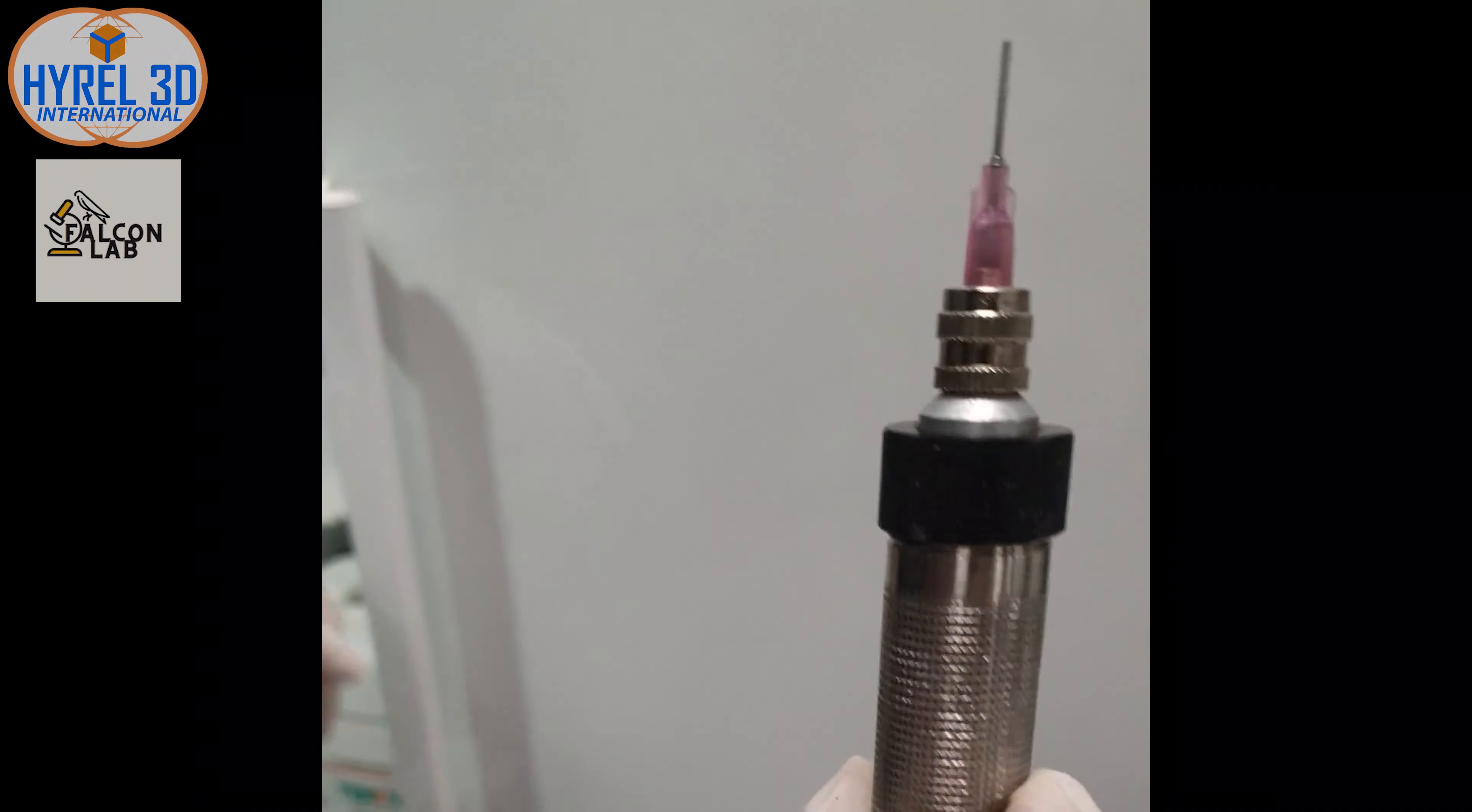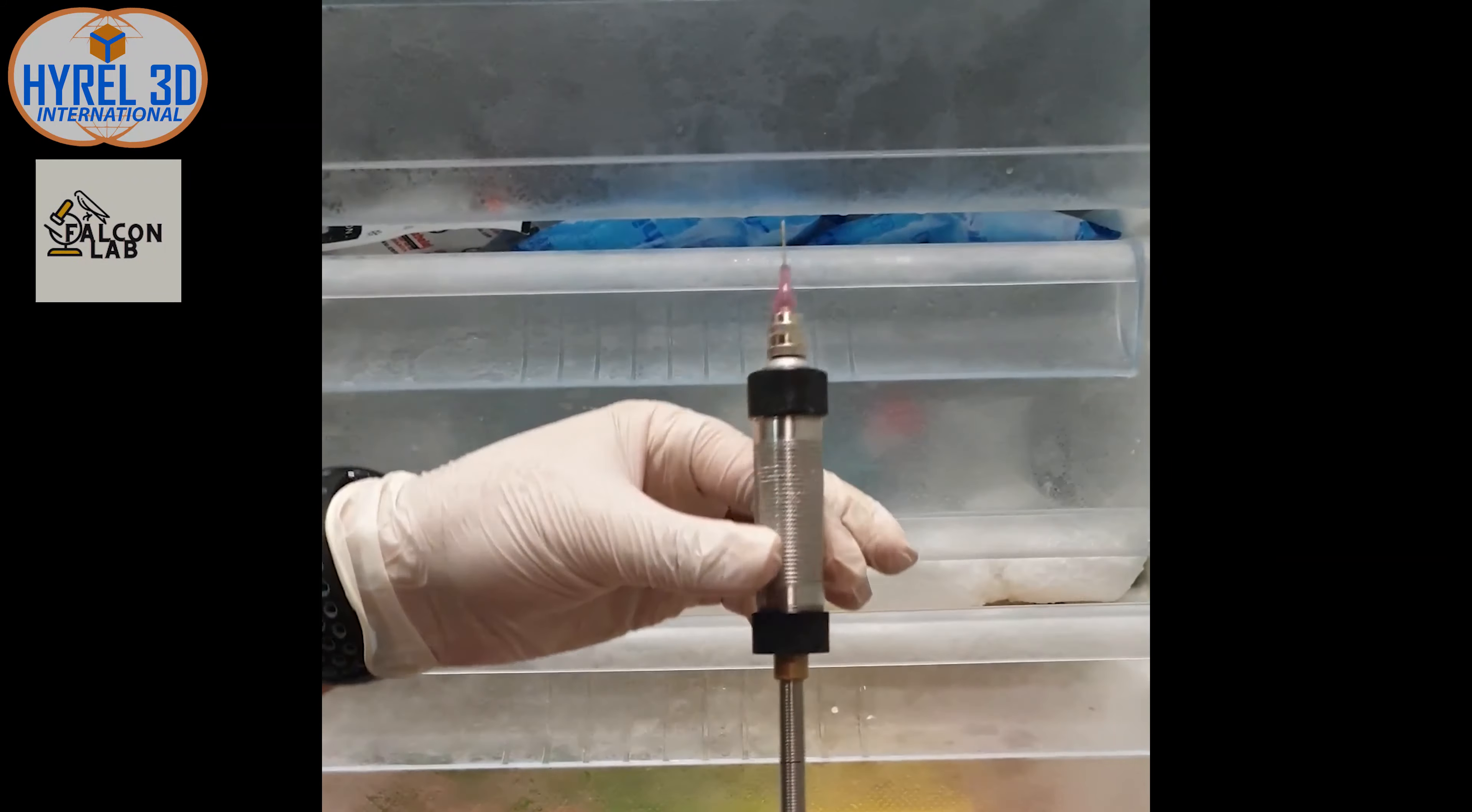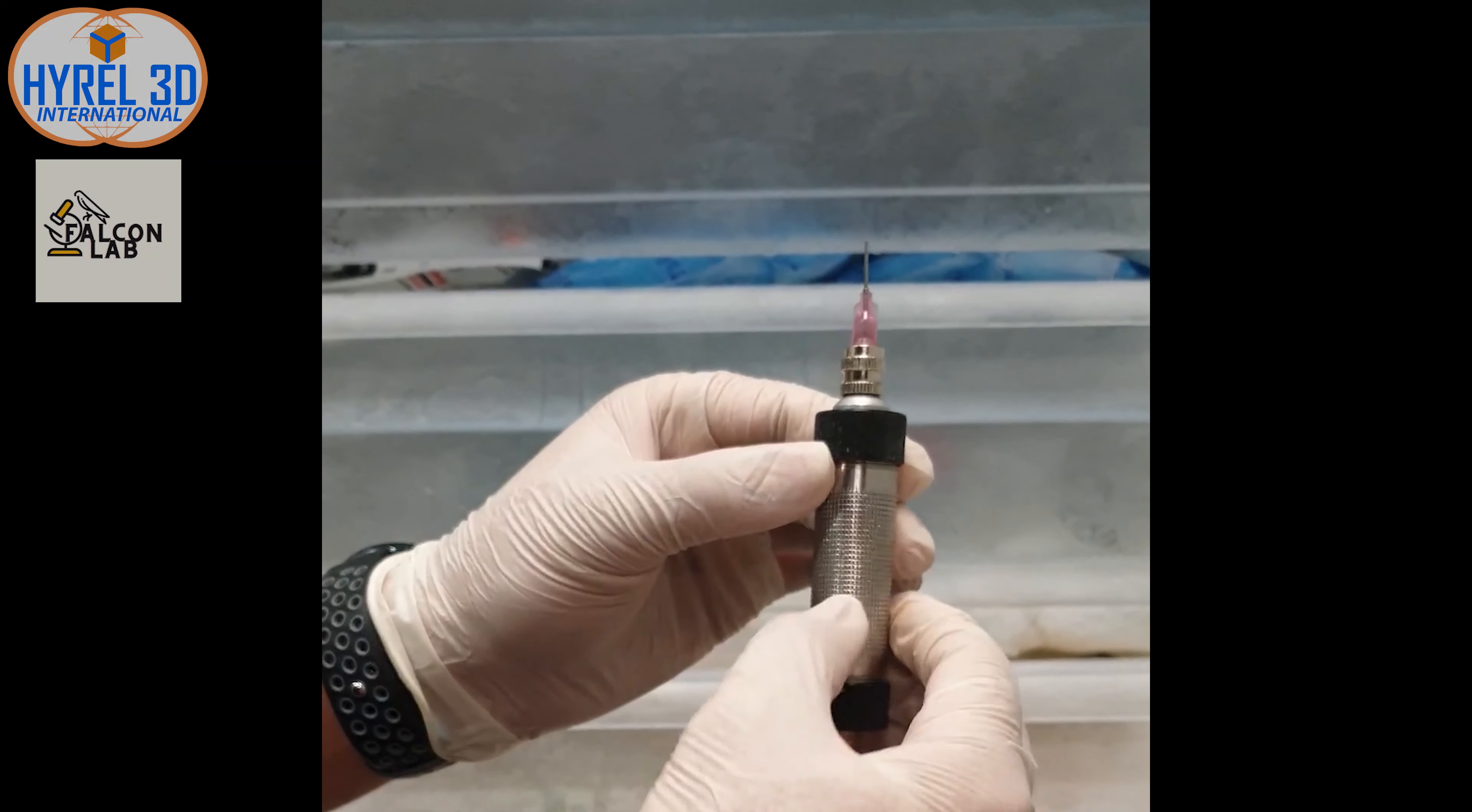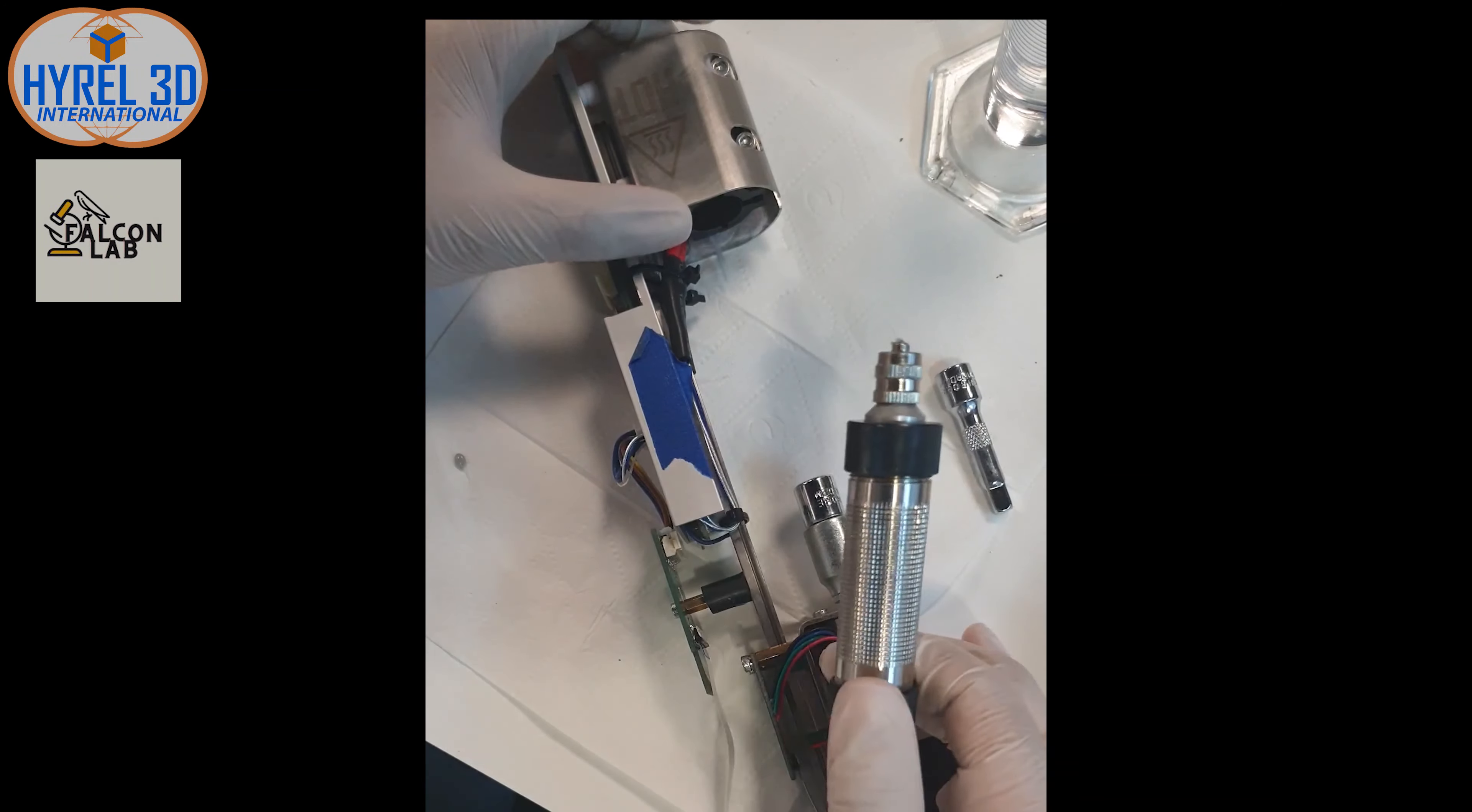We will store the cartridge at 4 celsius for 10 minutes to reach the desired viscosity. This duration depends on the content of the mixture and its additives. Always remember to place the cartridge vertically to ensure there are only air bubbles, foam, or any unwanted components on the surface. We don't want any spaces inside the cartridge before the cooling process.